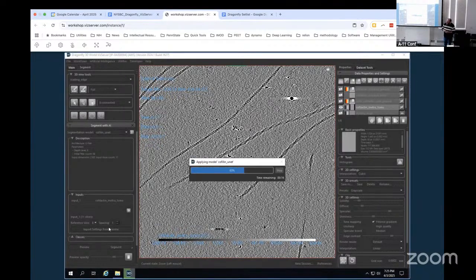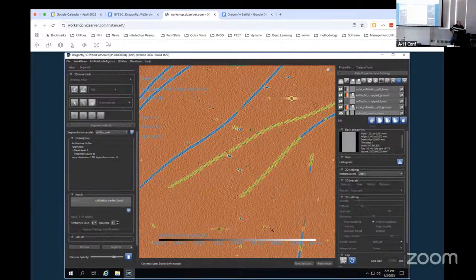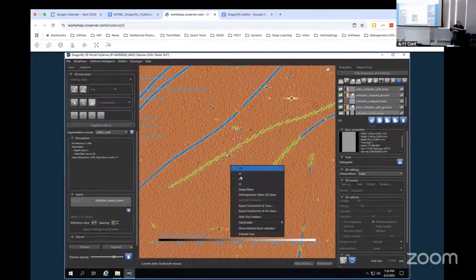A lot of times when I download a lot of MRCs or tomos from the EMDB, for some reason some people really like to put a 1,000 voxel thick tomogram, reconstructed in some crazy amount of space, and it's really only a little bit of biological material in the middle. And it'll take a long time to segment, so crop your tomograms. That's all I'm saying. All right.